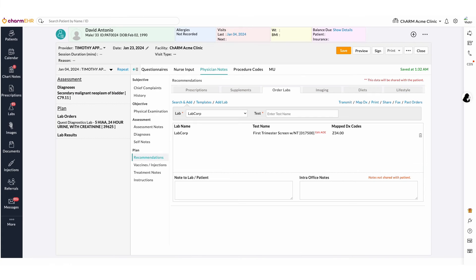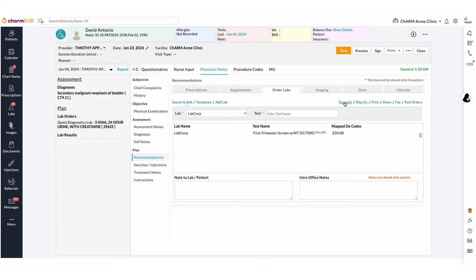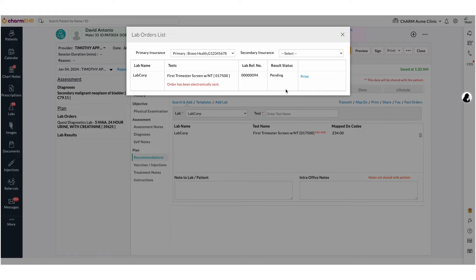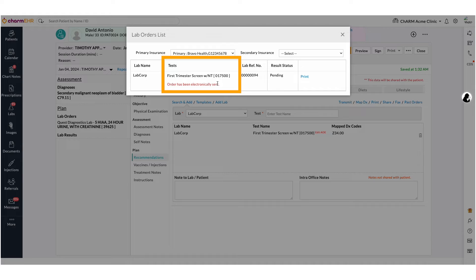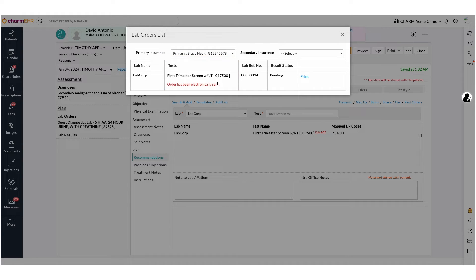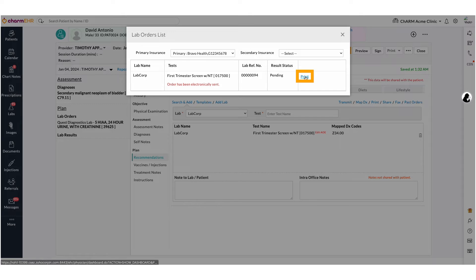Once it has been electronically ordered, click Transmit to view the status of the lab order transmission. This opens the Order Details view. Electronically sent information can be seen here. And you could print the lab order using the Print option.